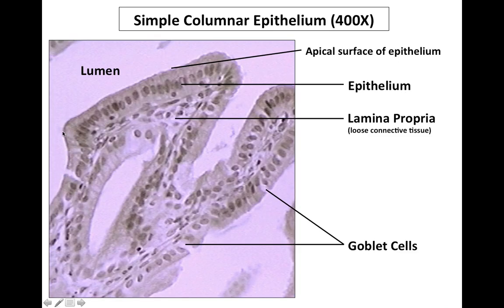Those little finger-like projections here are jutting out from the connected part of this hollow organ and into the lumen. So here's the hollow space. The cells themselves are still a single layer. So if you run your finger along the cells, starting here with the nuclei, you see they line up side by side in one row. All of these cells are adhered by their basement or their basal layer onto a basement membrane.